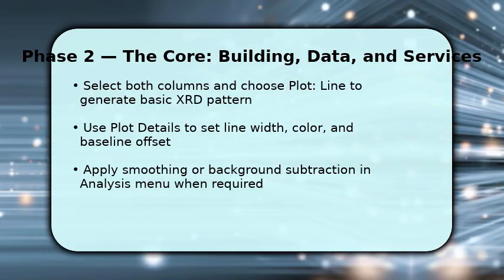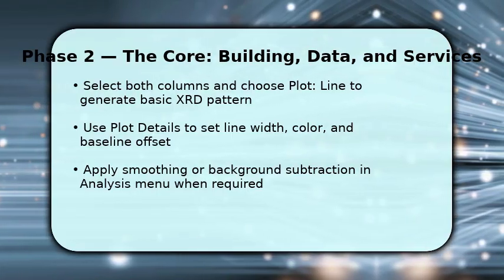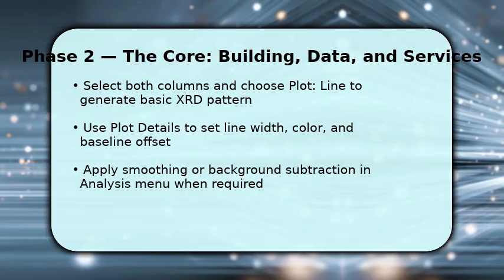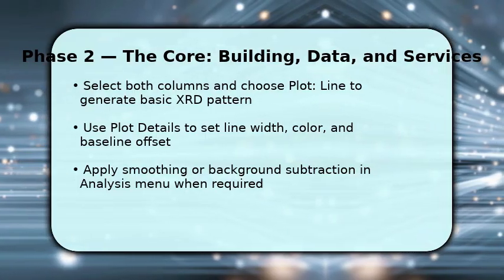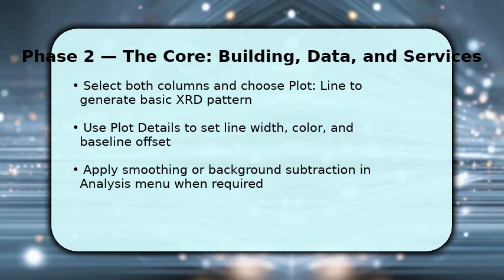Create baseline, then subtract. For overlapping peaks, try peak fit, multiple peak fit. Make sure to lock axis scales, set major ticks at sensible intervals, and add labels so your diffraction features are interpretable for viewers and publication.